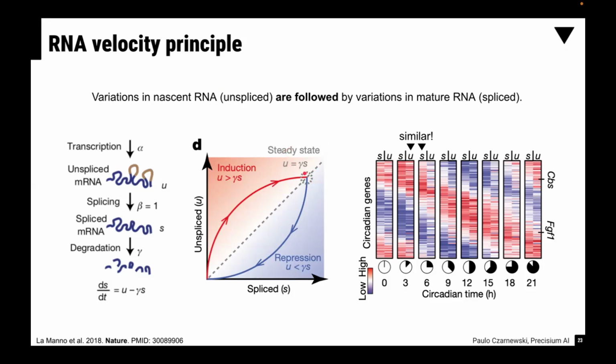And another thing that can happen is that this cell is producing interferon gamma because it's activated, and then maybe it can be silenced by, let's say, regulatory T cells, which shut down that signaling pathway. When that signaling pathway shuts down, this cell will reduce the amount of unspliced because it's not producing interferon gamma anymore.